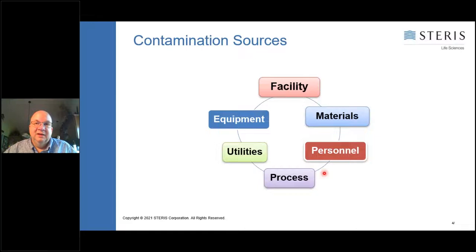Another key thing can be the processes. So what type of process are you doing in that clean room? Are you making tablets? Are you making powders? Are you making paste? So all these different procedures in the clean room. And we even talk about cold rooms where you might do blood fractionation. In these settings, you can have certain degrees of bioburden in the room that are unique. So for example, in cold rooms, we see a lot of molds. We also see Bacillus cereus that can grow under those, say, -5 to 5°C temperatures.